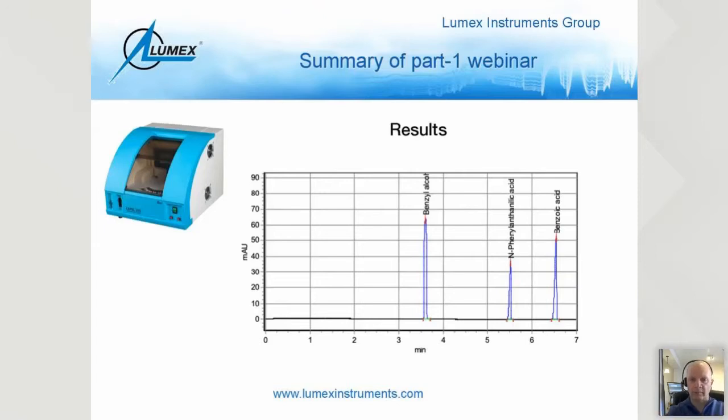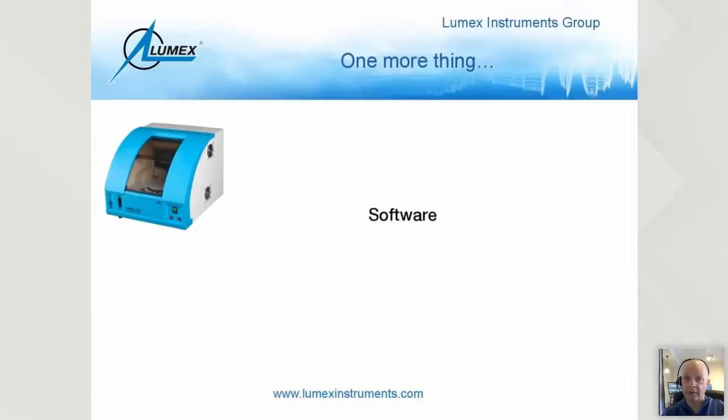But what we're going to move into now is, how do we obtain this data? And this is the next part of the puzzle that I want to include in how to set up a very good capillary zone electrophoresis method. And it is, of course, you probably already guessed, the software. And the software plays a very important role, and it's something that we tend to forget, especially when I come across people that are making their homemade systems.